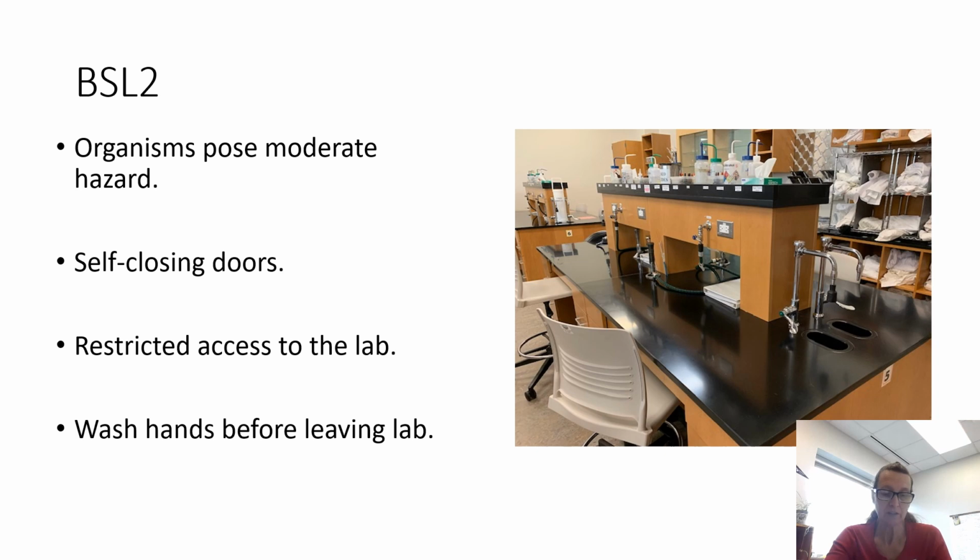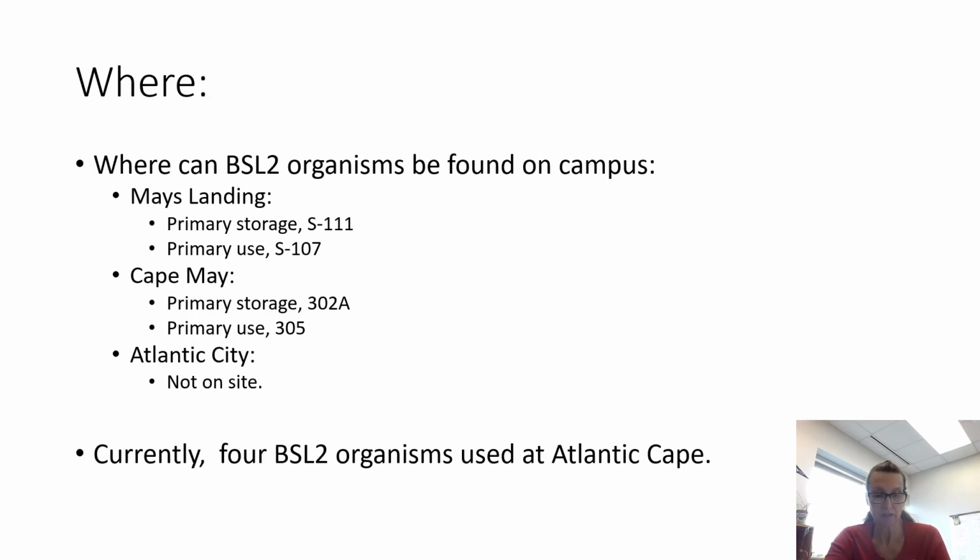In our BSL2 lab, we have 4 organisms with this classification. To enter a BSL2 lab, you must have training. At Atlantic Cape, the following labs are BSL2. Mays Landing, S107 and S111. At Cape May, 302A and 305 have this classification, and there is no BSL2 lab at Atlantic City.